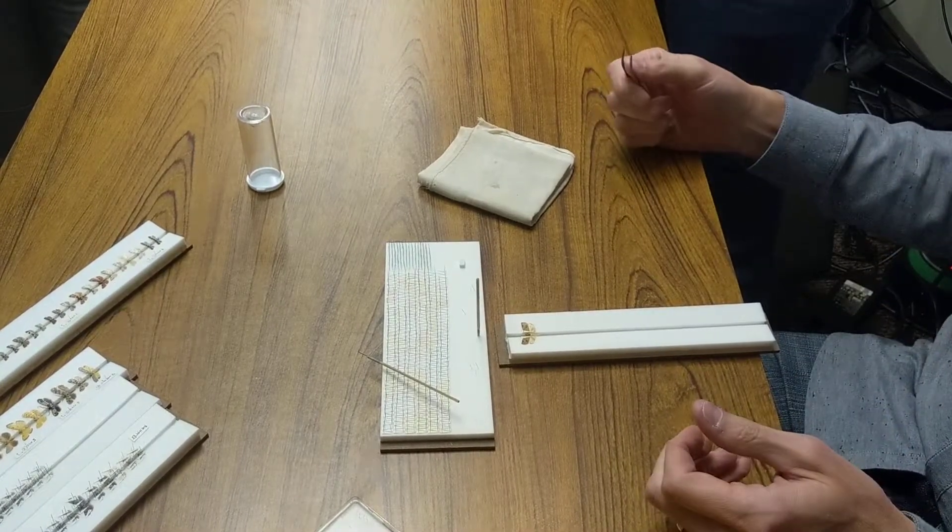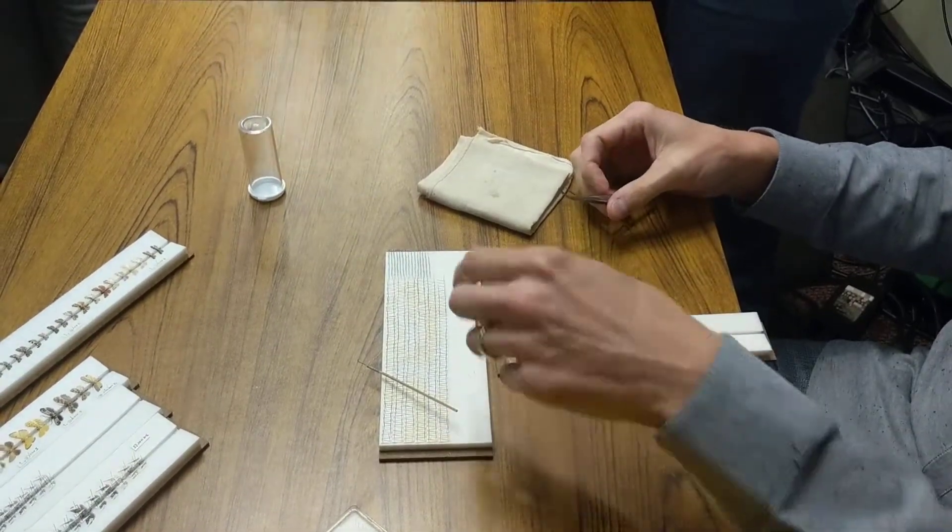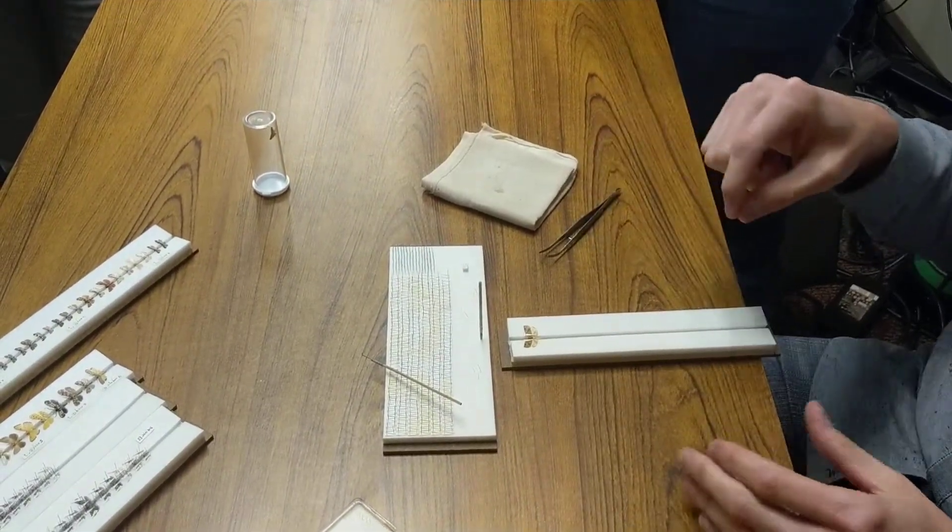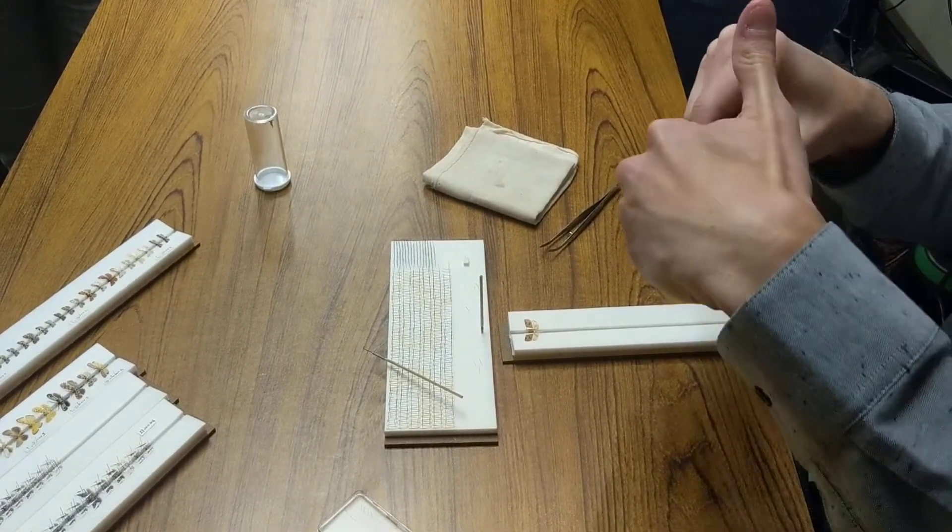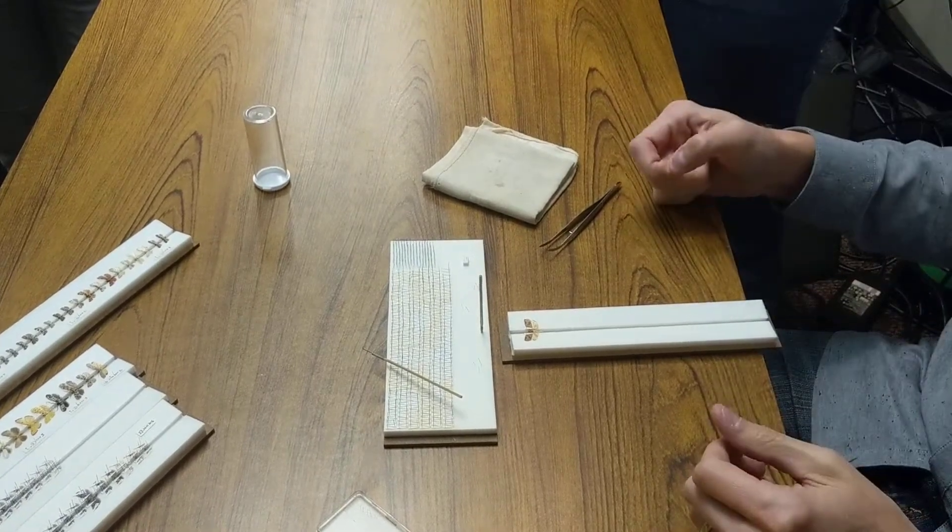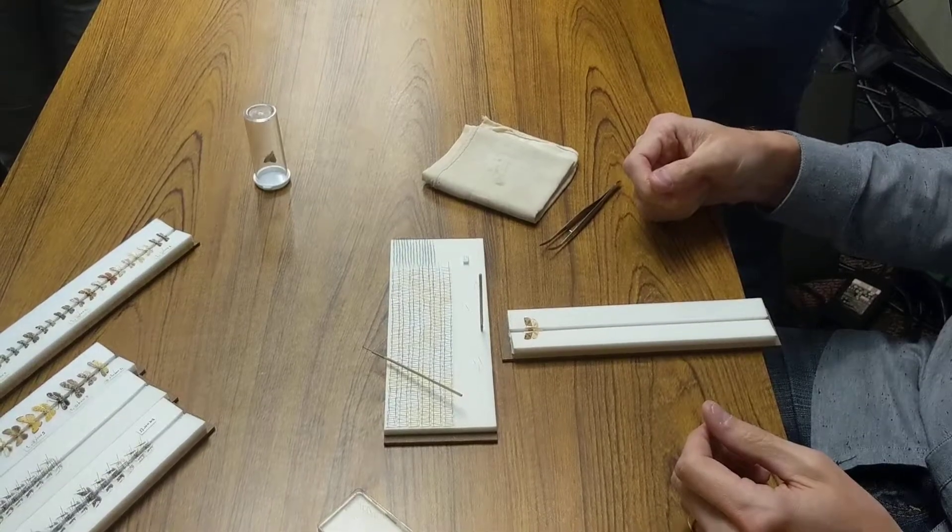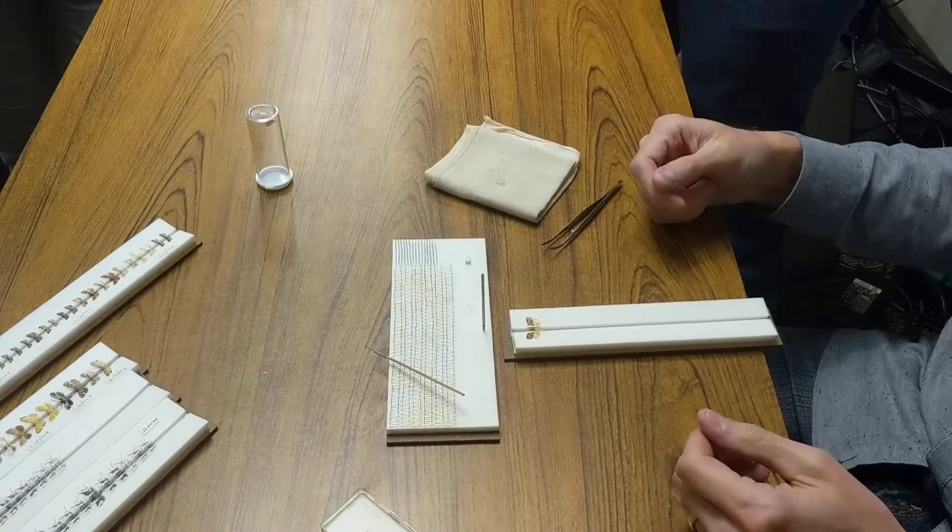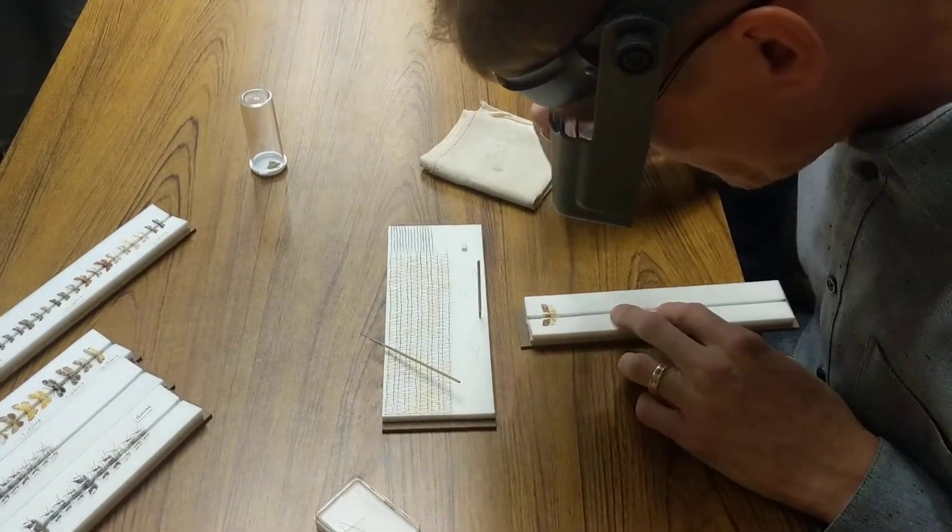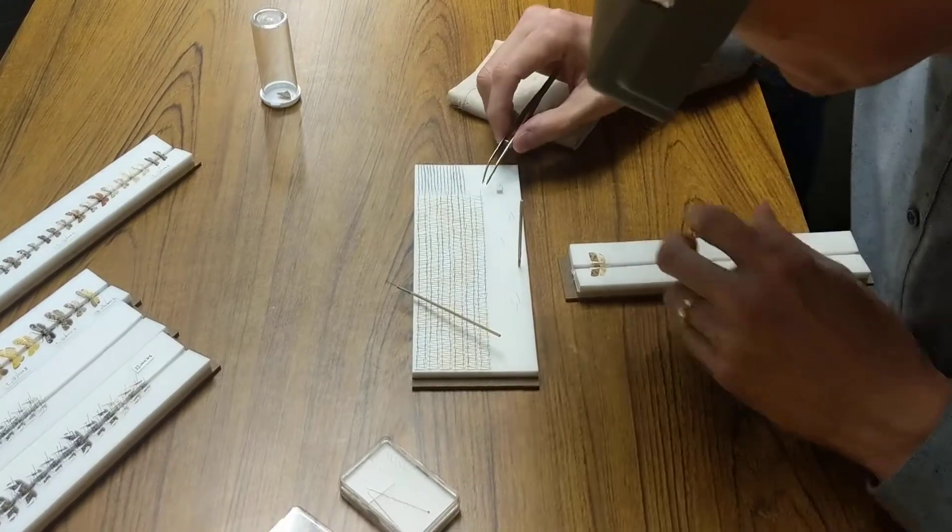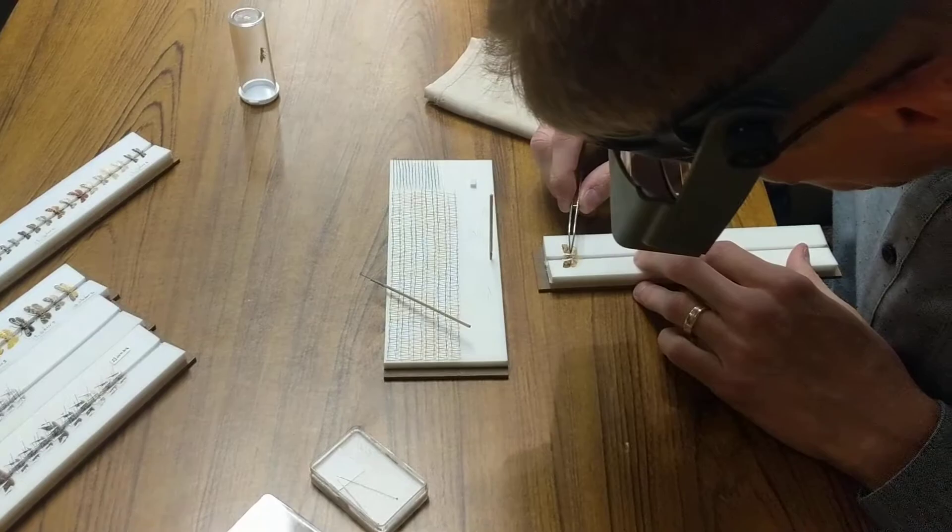This is the same for especially macros. If you need a really big moth like a saturnid or something, you would use a bigger pin, but you would put it right against the edge of that main vein on the costa and move it up. Put it in the middle of the wing and it'll rip. But these guys, if they're fresh, it doesn't matter a whole lot. It doesn't take much to move them.